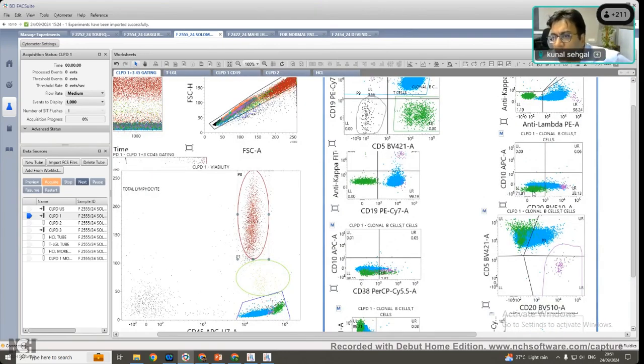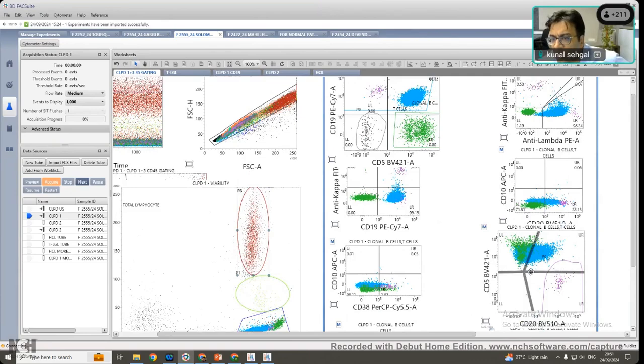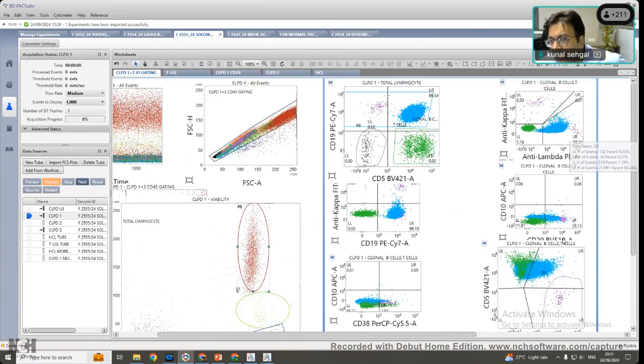Not only can I tell it is positive and negative, you also told me the normal 20 is bright and the blue cells are the dim heterogeneous. Mantle cell lymphomas normally express very bright 20 and bright light chain, whereas CLL commonly expresses dim heterogeneous 20 and a dimmer light chain. That is two of the features. In addition, we need additional markers, like somebody was saying 23. Now there are additional markers like 200, 43. Nowadays we use a lot of 200 and 43. CD200 expression is practically present in almost all CLLs and absent in all mantles practically.